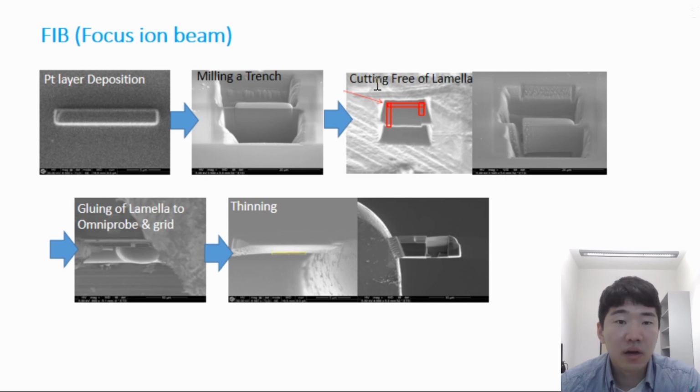The single ion gun produces a well-defined, controlled beam of gallium or argon ions, which are usually used as bombarding ions. With this bombardment, the focused ion beam thins or etches to make the desired sample.